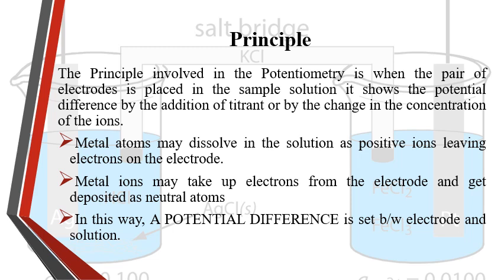It can be used in all kinds of titration like acid-base titration, redox titration, and complexometry as well. It is based on potential measurement of an electrochemical cell without any appreciable current, using electrodes to measure voltage from a chemical reaction.